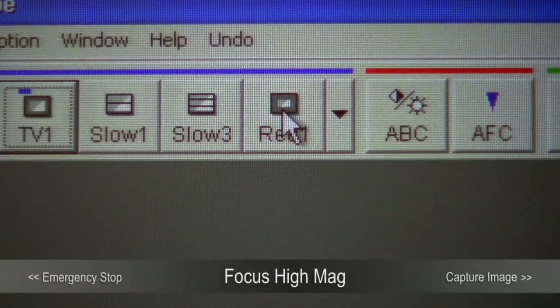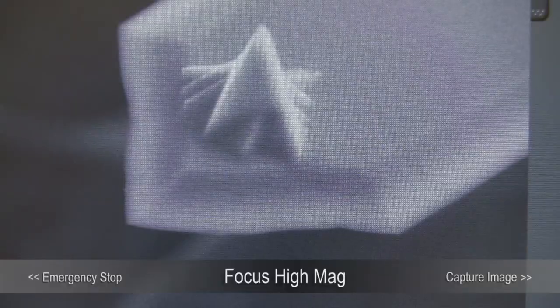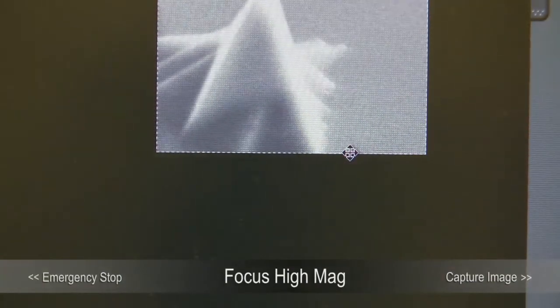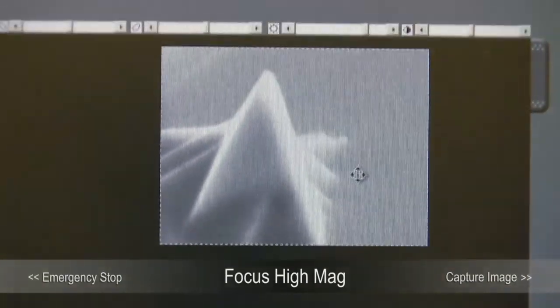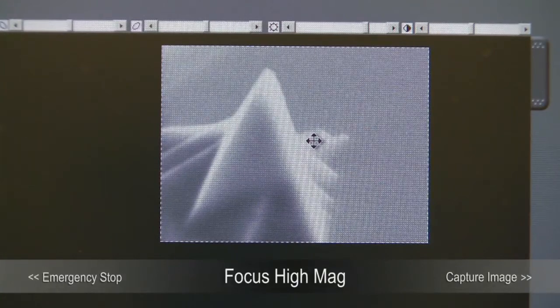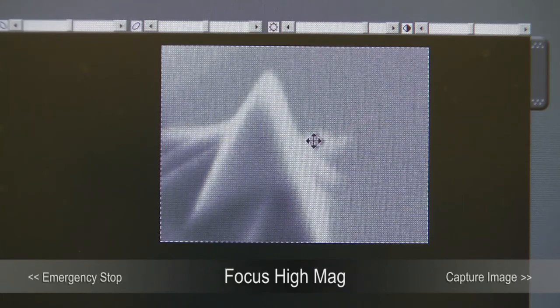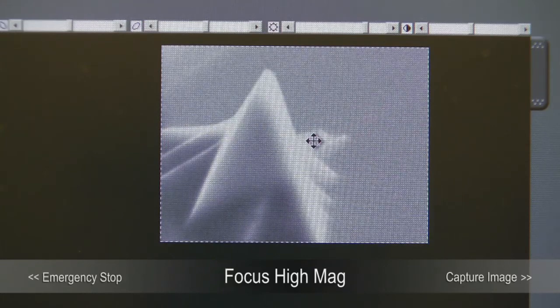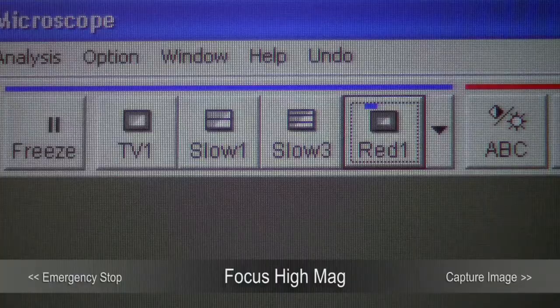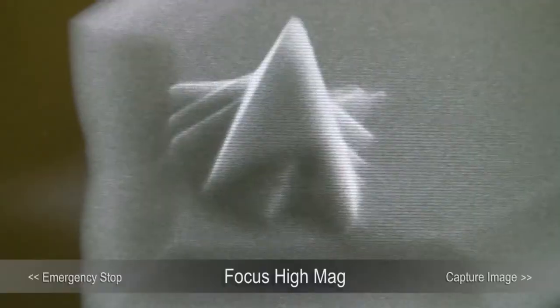To adjust the focus, you can choose the reduced scan mode. What it does is scan a smaller area but increases the integration time. When adjusting the focus you want fast response — scanning a small area with increased integration time updates the image faster and allows you to focus better. After you finish adjusting focus, click TV1 to go back to full screen mode.